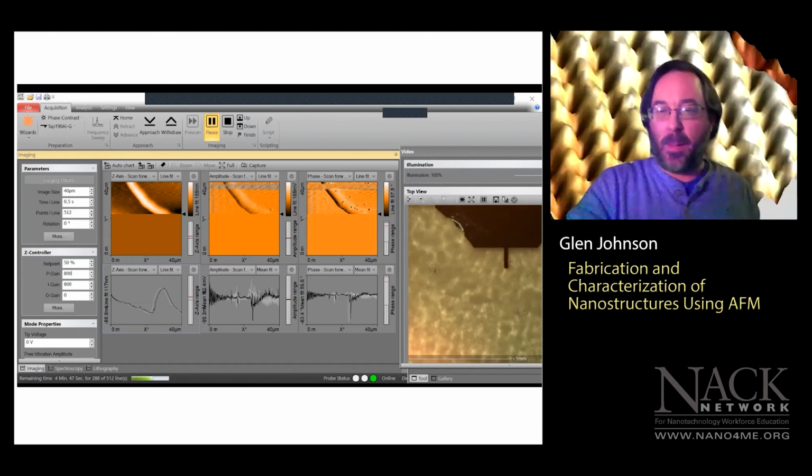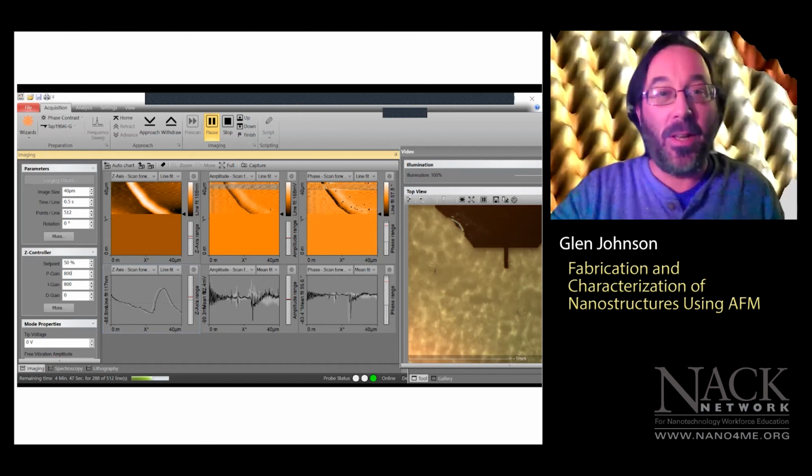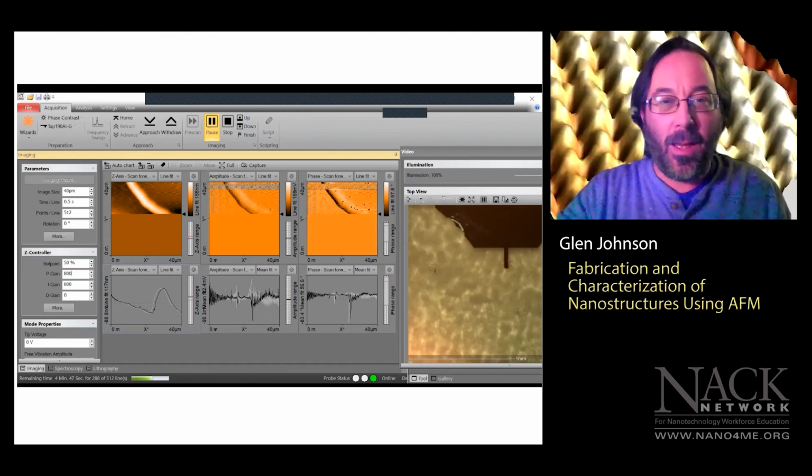He wants to know how susceptible the AFM is to nearby movements: a person walking by, a nearby truck, or a loud noise. It's very susceptible to vibration. As a matter of fact, why not try this here real quick. Let me share this with you again, and I might be able to show you an example.